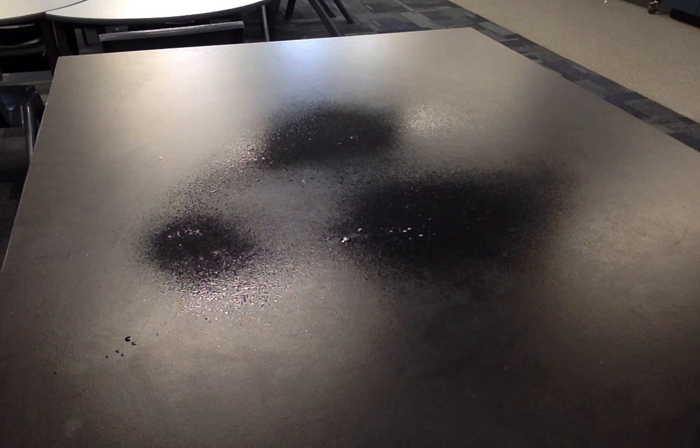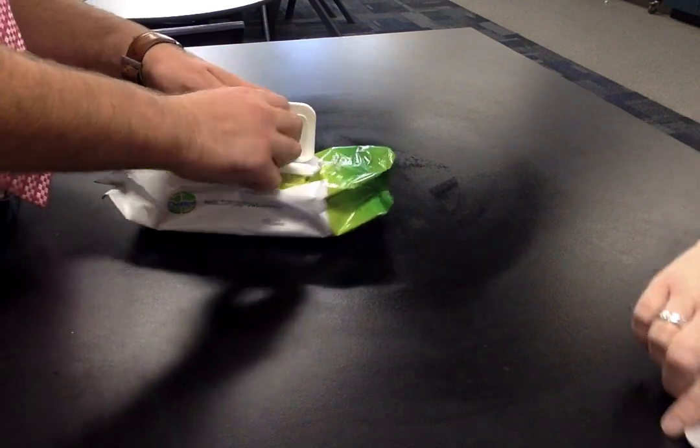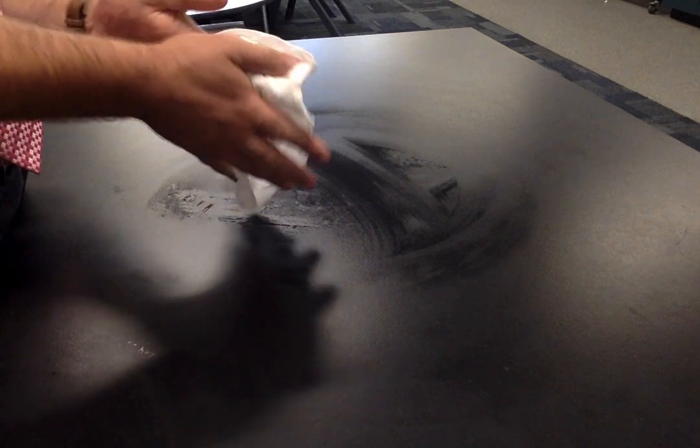Hello students, this is a video to accompany task 1 — the petrifilm whole leaf vs pre-cut salad leaves experiment. First, I'm going to sterilise the bench and also my hands, and allow it to dry before continuing.